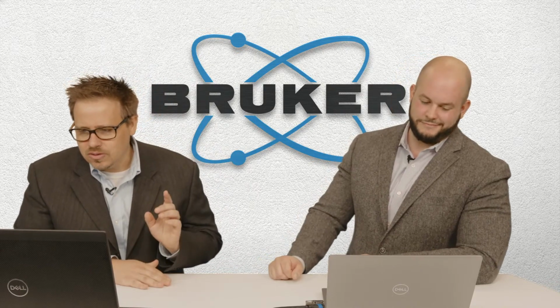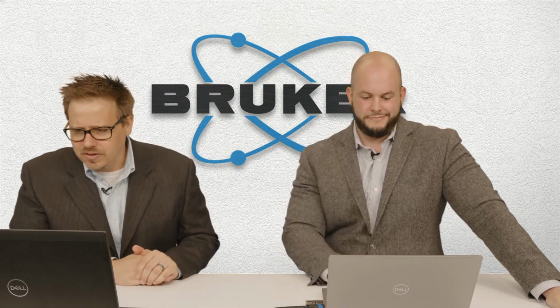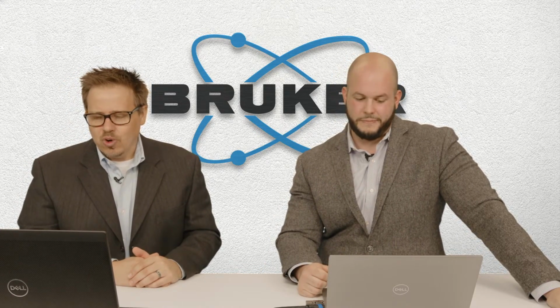So, thank you to Zhao Dong for that question and Shri for the previous one. Next question from ND is, do you need the space group for pole figure analysis?